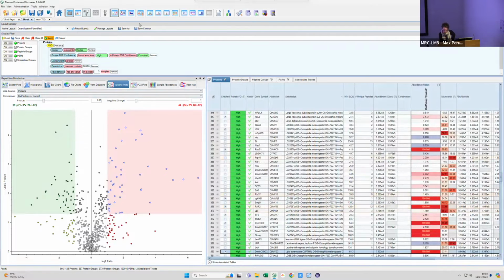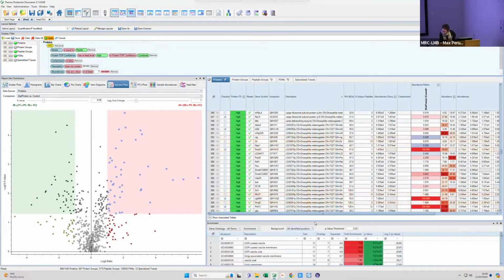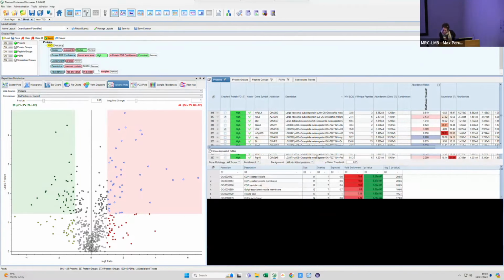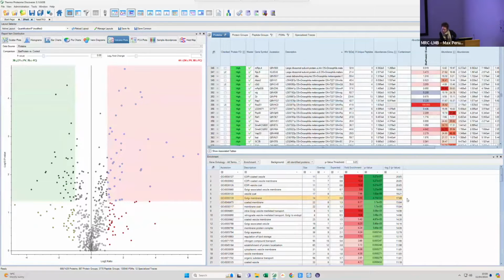And one way to pull out the enrichment analysis is this tab here. It will let you know if there's any specific enrichment. In this case, there's a very obvious enrichment. I'm going to go, yes. Where did I click? Here, on this icon over there. Then a plot as well.